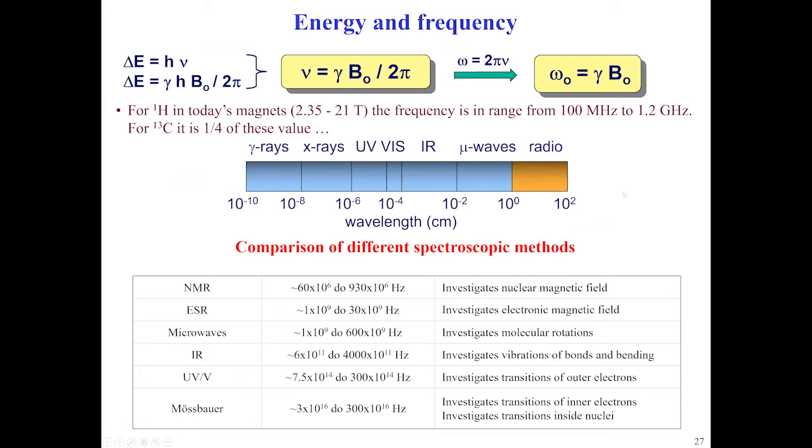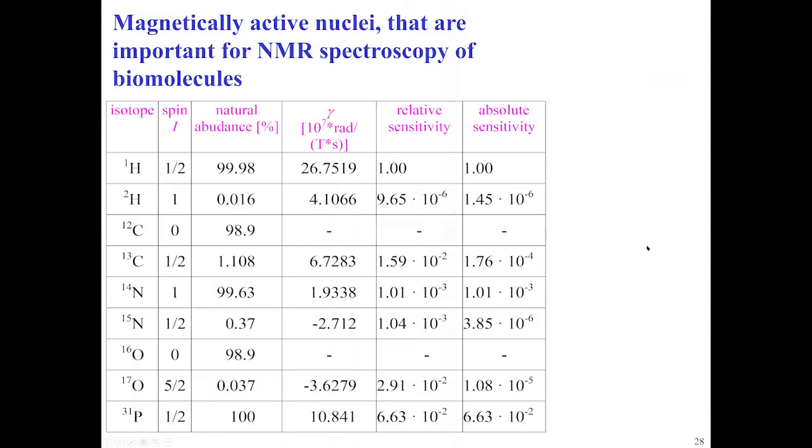So NMR has this unfortunate name, nuclear, and people would consider that we are dealing with something like excitation of internal electrons and so on. It turns out this is just a property of a nucleus of an atom, right? So the frequencies we are dealing with are very much in the radio range. So far, far away, 10 to the 10, so 10 orders of magnitude away from anything kicking out internal electrons and so on. So really non-invasive in this sense.